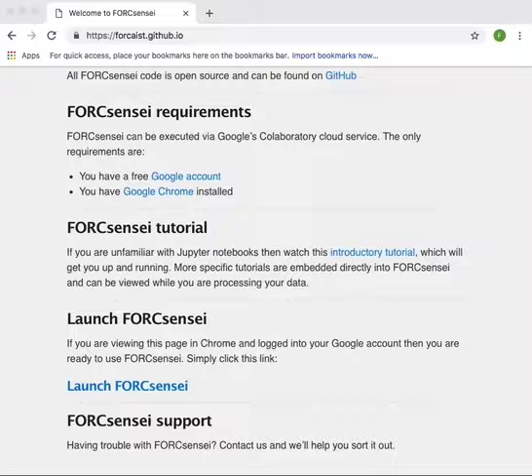Are you sure you want to reset all runtimes? Yes, this will just start us from the beginning. And you can see now that we've got a little icon here that shows that processing is occurring. We may get some updating text, but eventually this command completes. You can see we've now got a number 1, which means that the code has been completed.